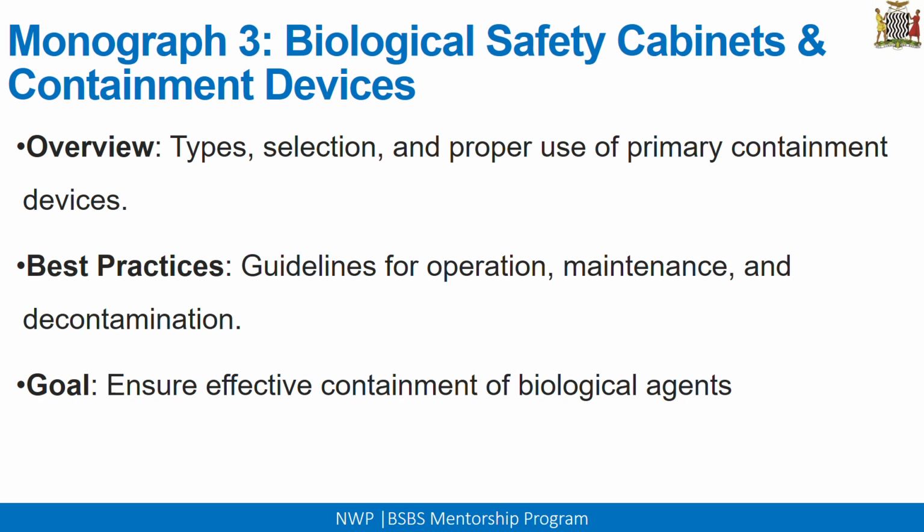Then also the best practices. It gives you guidelines on the best practices when you are operating your biosafety cabinet or any other containment devices. What are the best practices when you're operating? What are the best practices when you're maintaining these devices? As well as how do you properly decontaminate your devices? What is the proper best practice for that? So what's the main goal for this monograph? It ensures that there's effective containment of biological agents. That's the main goal.